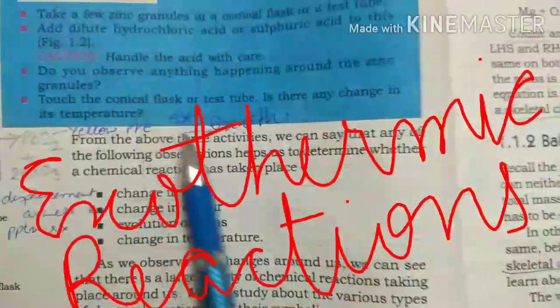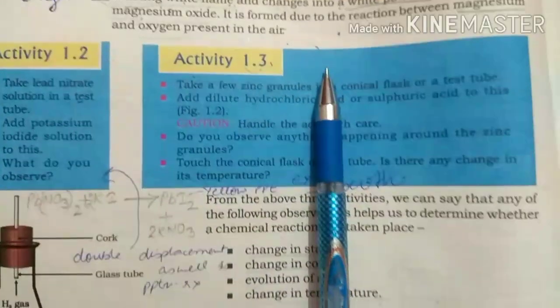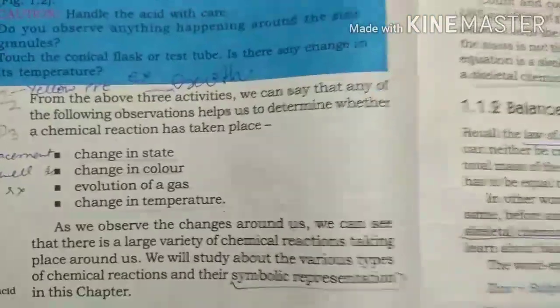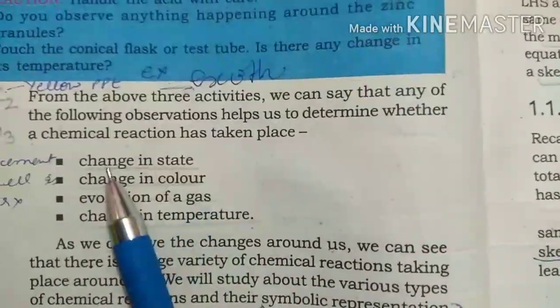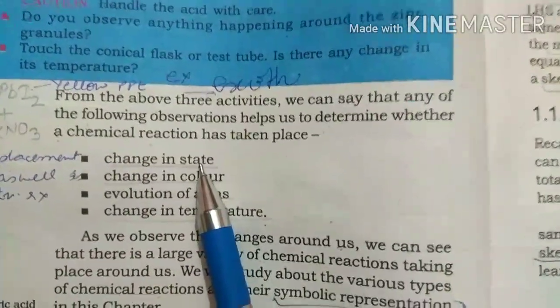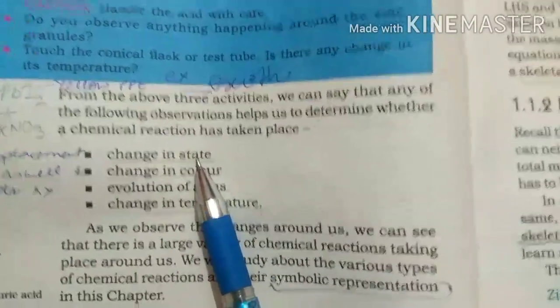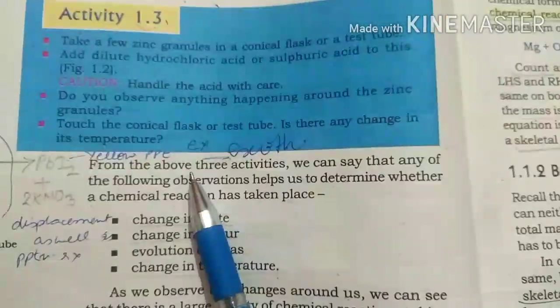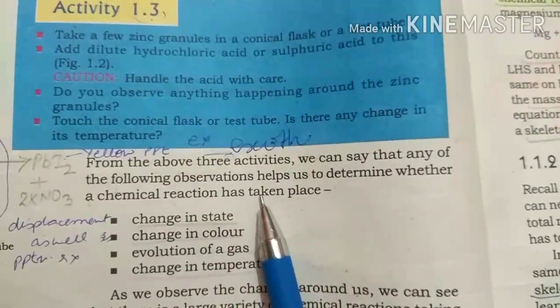Now, since we have completed 3 activities, 1.1, 1.2 and 1.3, now we come to certain conclusions. We have seen 3 different chemical reactions. From these reactions, we can say that if we observe any of these changes, for example, change in state. State means solid, liquid or gas. The reaction will be a chemical reaction. Okay. For example, in this reaction we have used solid granules and liquid acid. We have obtained gaseous product.